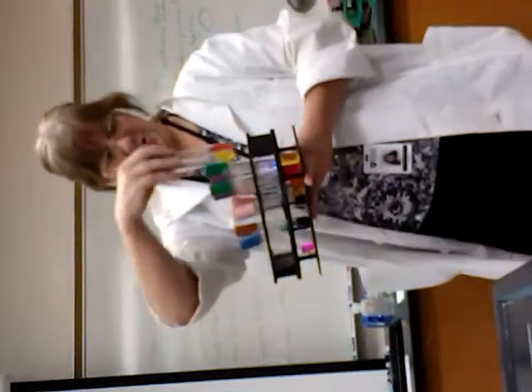Positive produces acids and changes the color indicator to yellow. So which one will be positive is the yellow. Also note some of the organisms. Know what organism is positive for urease. Know what organism was positive for citrate. Know that. The Durham tube is for what? Gas. Gas reaction.